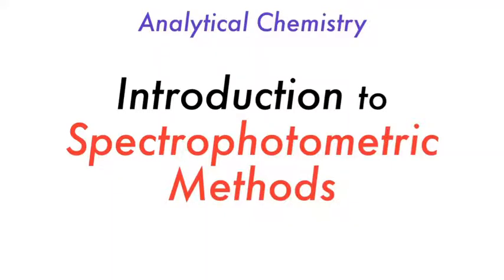We'll start off learning a little bit about how these instruments work, and then we'll talk a little bit about how light works, and then after that we'll talk about the specifics of a few different spectrophotometric methods. Mostly we'll be talking about absorption methods, so that will focus mainly on UV vis and also on the measurement of atomic absorption and atomic spectroscopy in general. Okay, so let's get started.